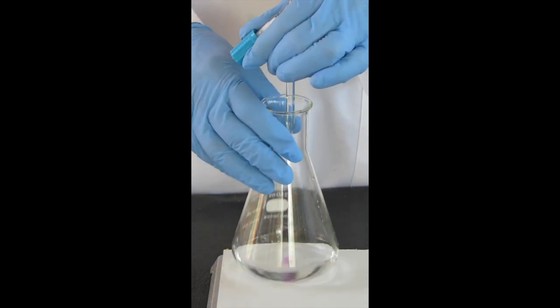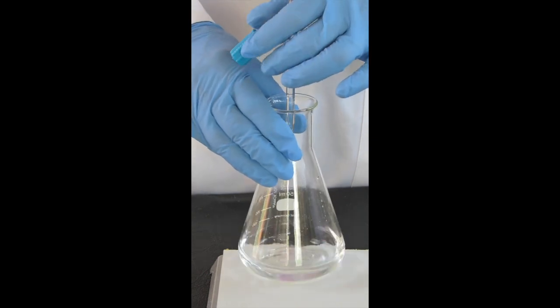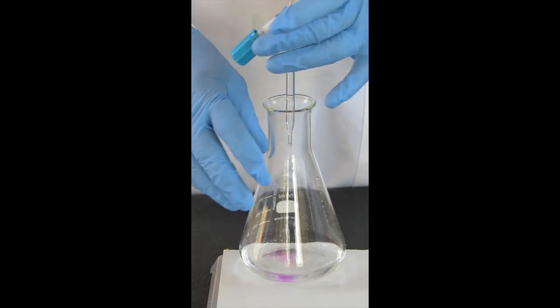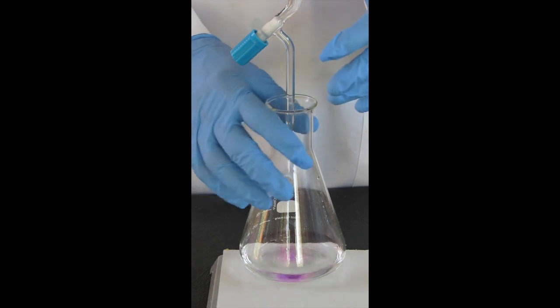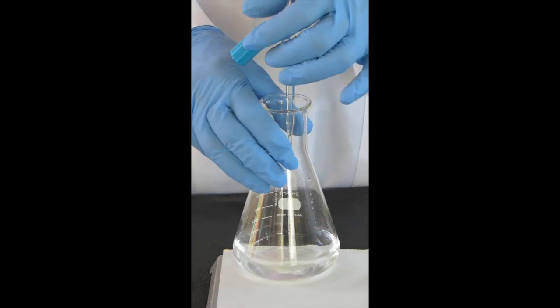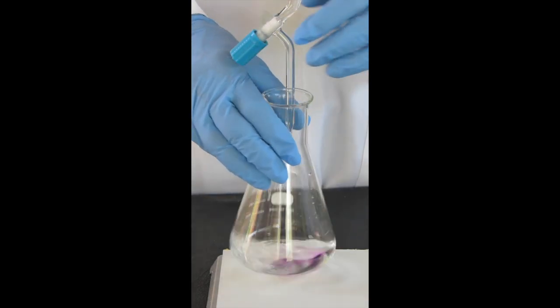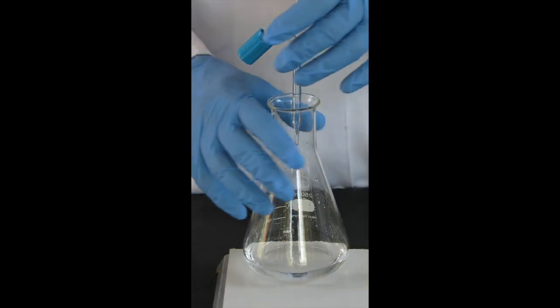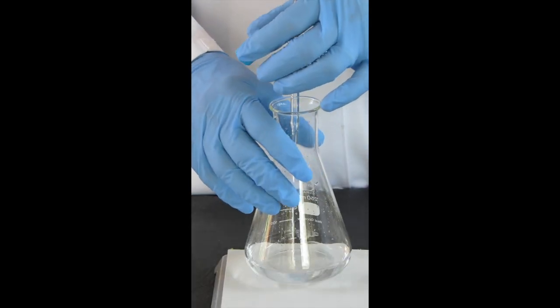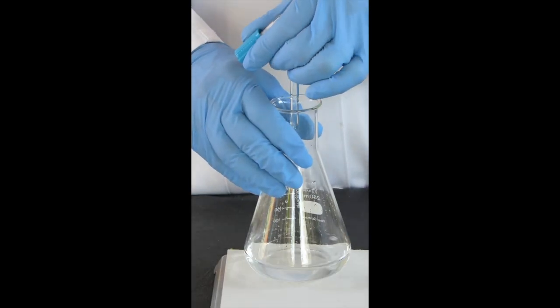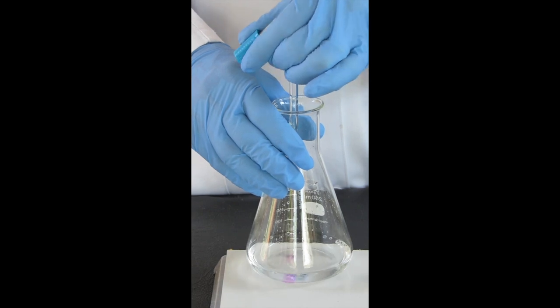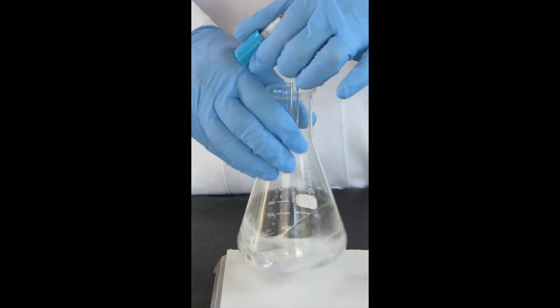At the moment I'm just going drop by drop, and I'll continue to do that. As you continue to run the base in, you'll see that the pink color starts to persist for longer. At this stage we can use a bit of deionized water to rinse off the tip of the burette.